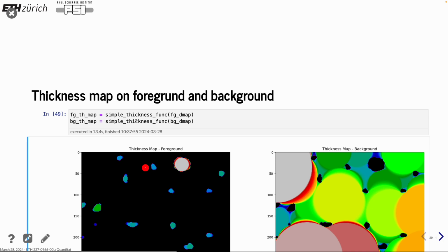Now you can see here, there are some pores in some material, and you can see first this is just plain blue, but in this case it's not a fully perfect sphere, and the effect is that the closer you come to the edge, you will have some different radius that comes in. Same goes for this one, where you look at the distance between these holes. This is almost a sphere, and the sphere can be squeezed in a bit here, but then at some point the radius has to decrease, and then you see a difference in the colors here.